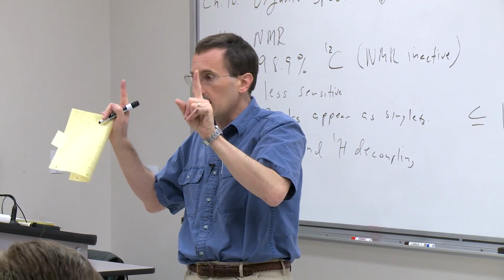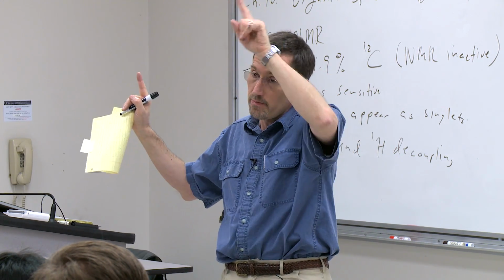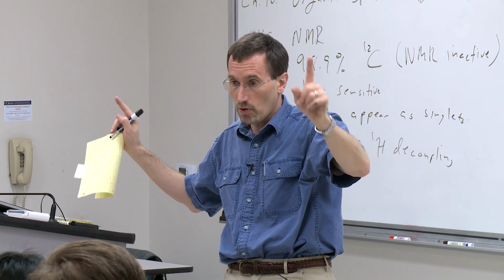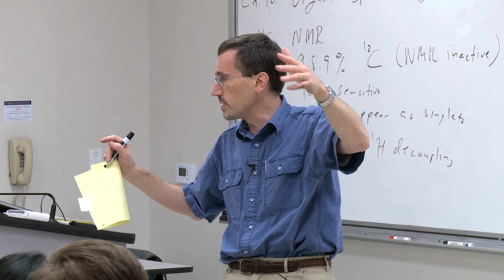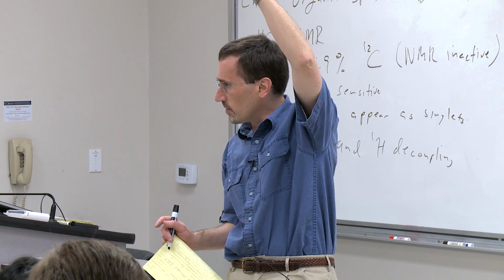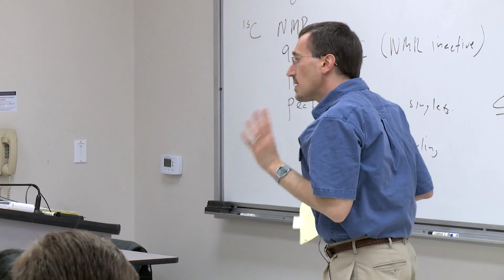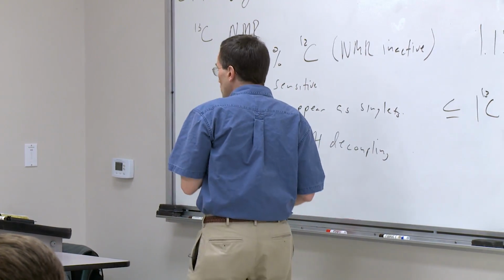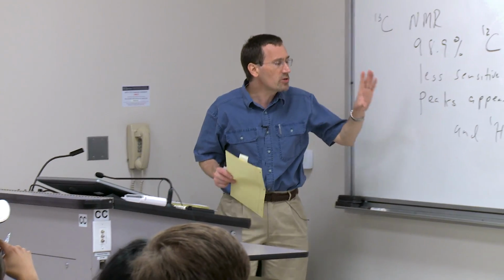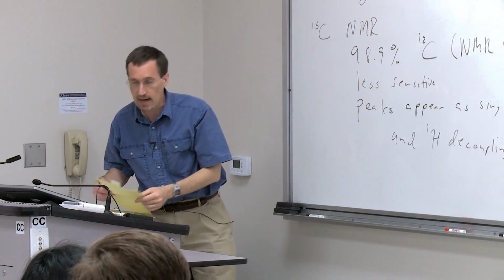A doublet is half as big as a singlet. The middle peak of a triplet is half as big, and the outer peaks are a quarter as big, and then it's smaller for quartets and so forth. So all of this concentrates your signal into a single peak, bringing it above the noise. Now, when I come to HMQC, we'll see how we're using the one-bond CH coupling, but you can just think of it as sort of magically decoupled, not coupling.